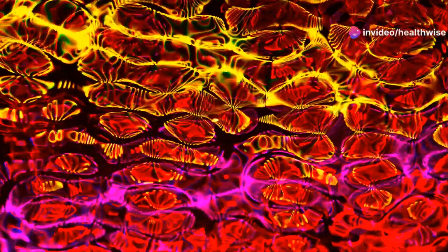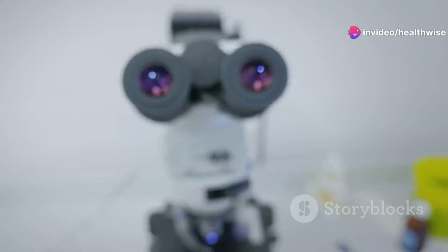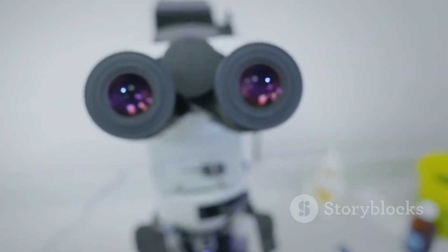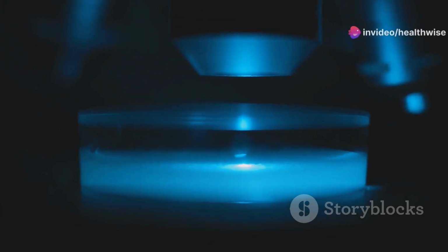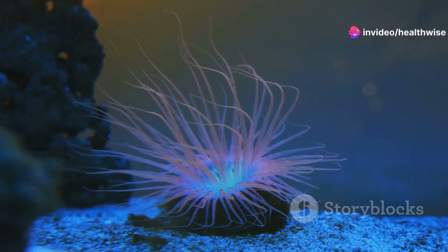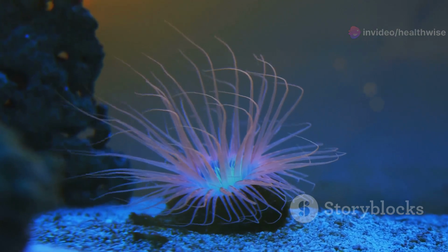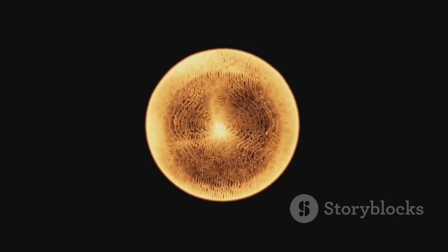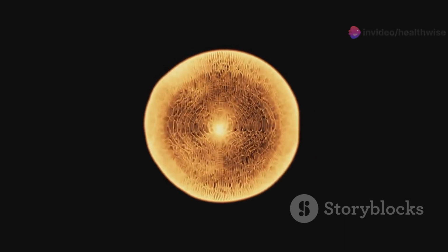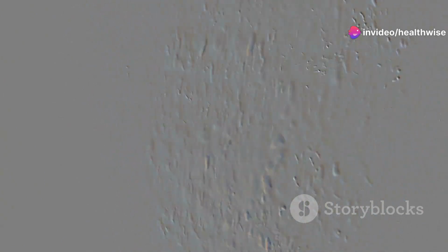Imagine painting different parts of a cell with light, each color revealing a specific structure or molecule. This is the essence of fluorescence microscopy. This technique relies on special dyes called fluorochromes. These dyes absorb light at one wavelength and emit it at another, longer wavelength. When illuminated with specific wavelengths of light, the fluorochromes attached to the specimen glow. This allows us to visualize specific components within cells, like proteins, DNA, and even specific molecules within these structures. We can track their movement, interactions, and changes over time.